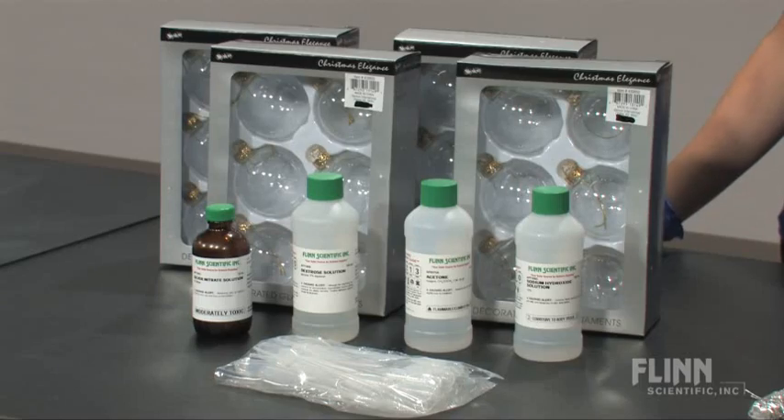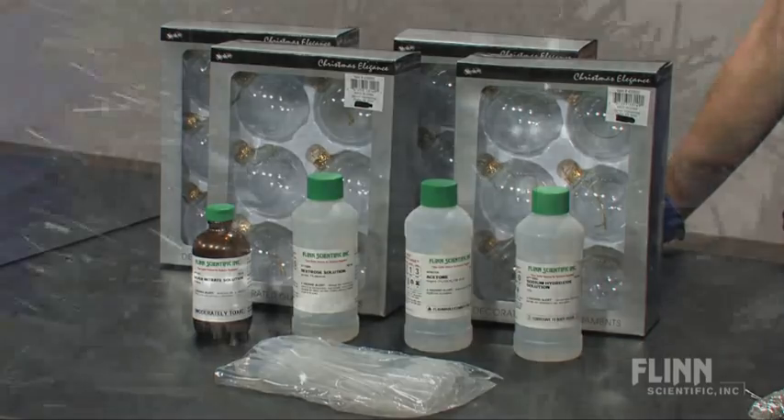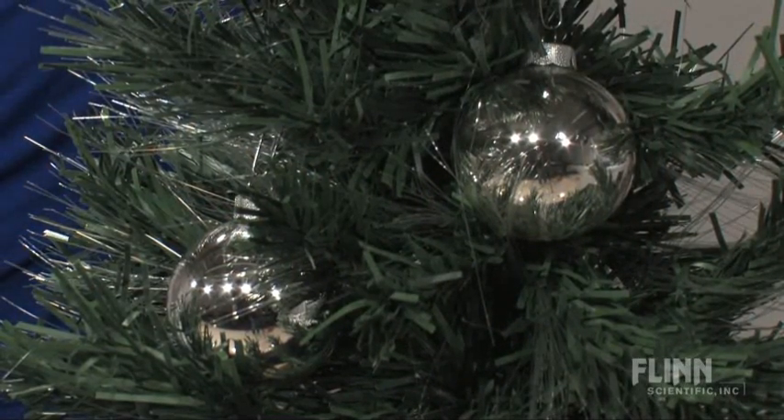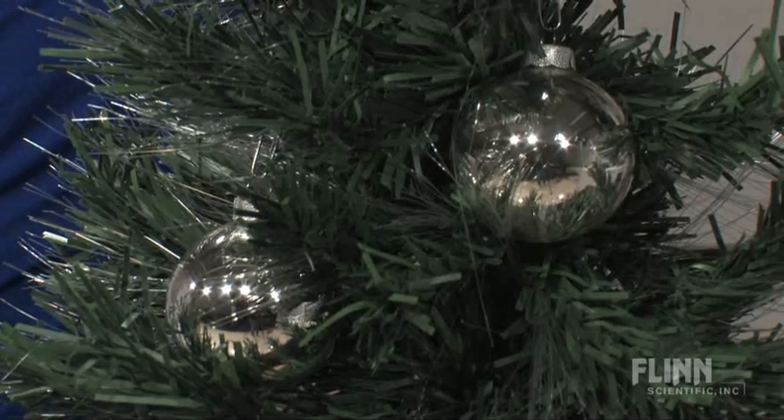Flynn's silver ornament kit includes 24 glass ornaments and four solutions. Simply swirl the solution in the glass ornament and watch as a thin silver layer coats the glass. This process reflects the way that silver mirrors are produced.